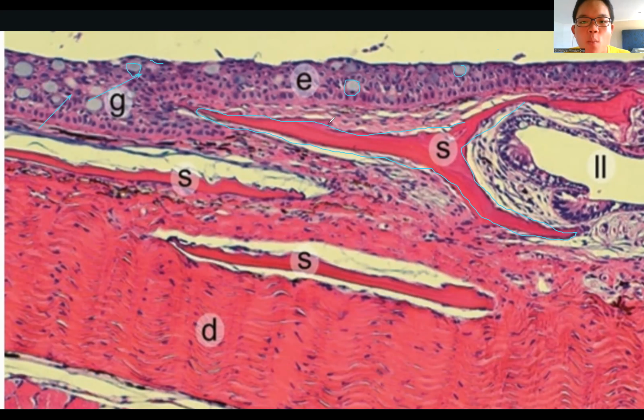Moving below, we can start to find a layer of collagen fiber. This is the stratum papillare of the dermis, or the projections of the dermis right here. The stratum papillare of the fish's dermis is not like that of mammals, in which it is more messy. And right here, we can find the special structures known as scales. Scales are a combination of keratin and mature bone tissue.